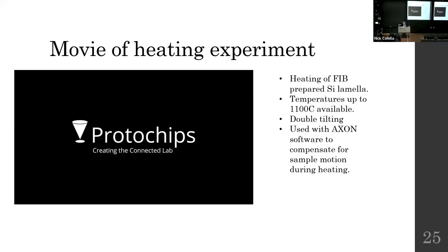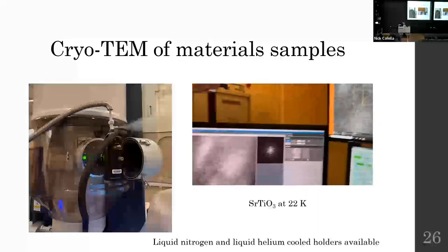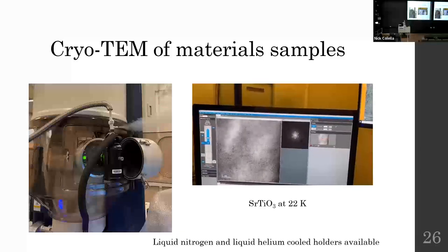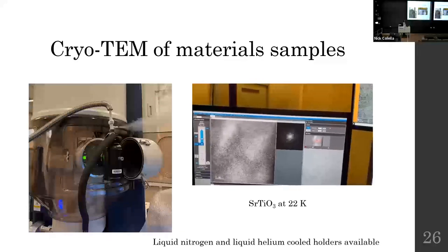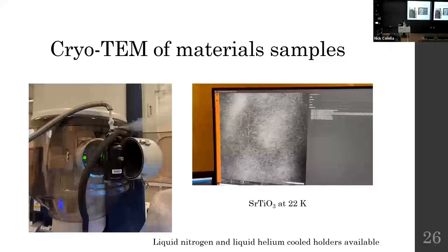And we got an advert for the company who we were using for it. I should have edited that out of the video. But that company actually have quite a cool thing. And they call that Axon, which is a silly name. But what it does is it takes control of the microscope and tries to improve your in situ imaging.